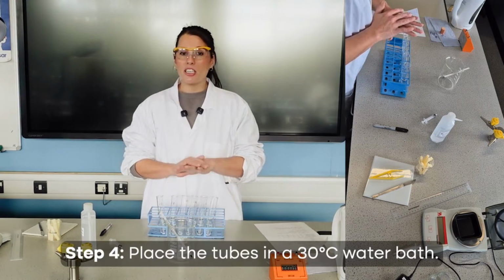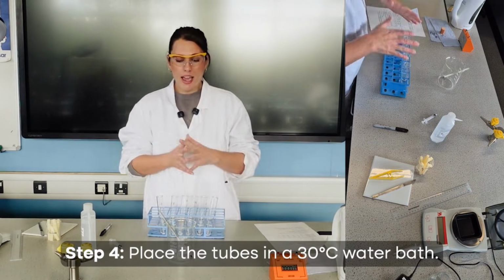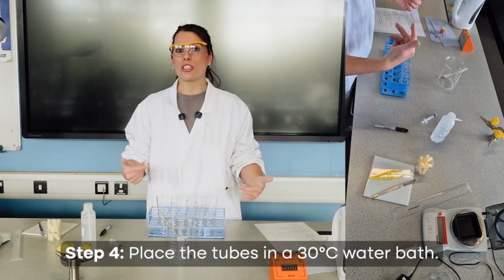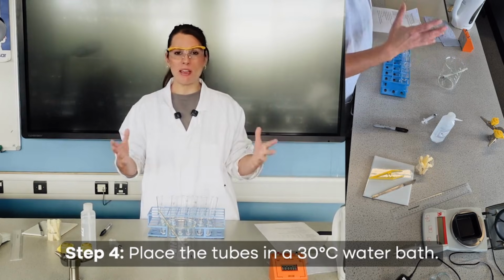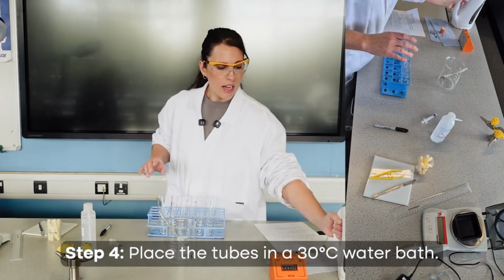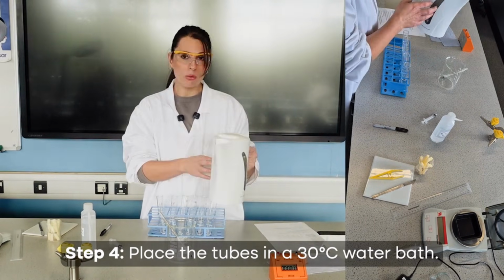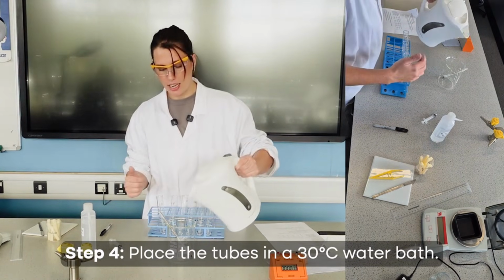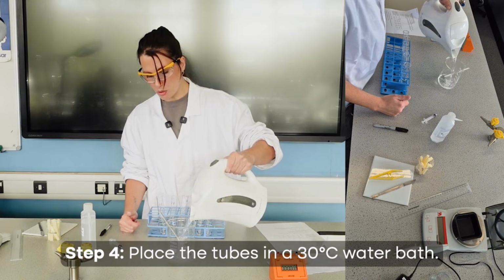So we said we're going to be controlling the temperature, and I'm going to put them all at about 30 degrees C because that's going to be warm enough that we should get a set of results within the space of an hour's lesson. So I am going to pour it into here. This is boiling water from the kettle. This is probably already cooled down to about 60 or 70 degrees C. Let's see what it's at so we know how much cold water to add.